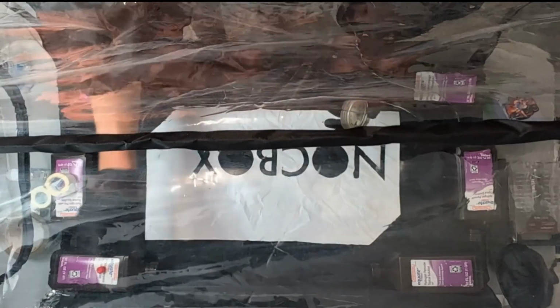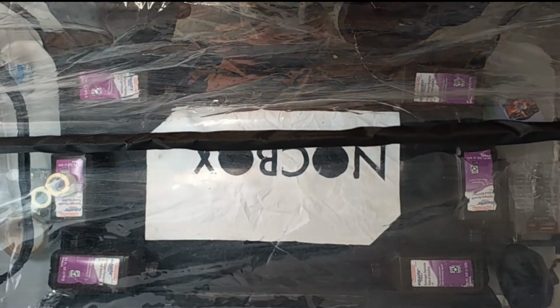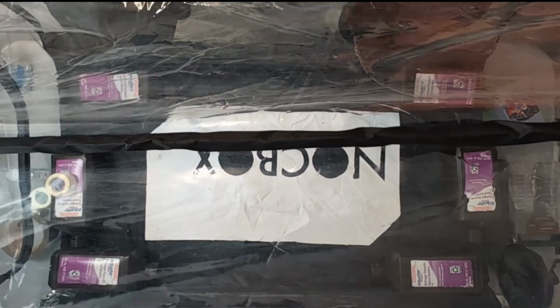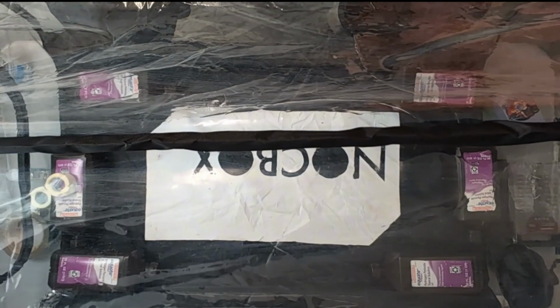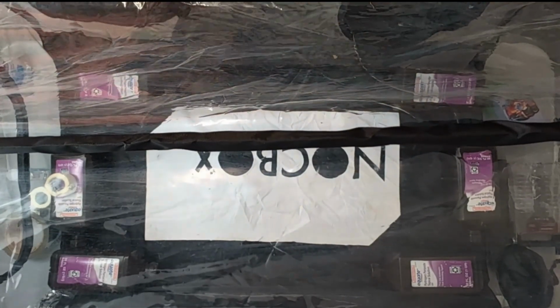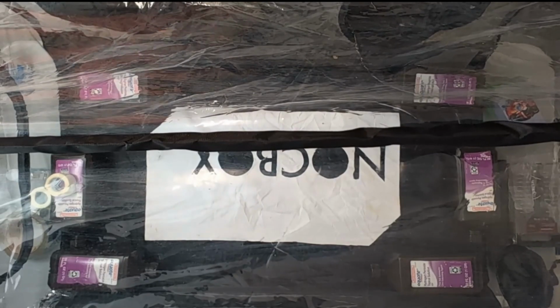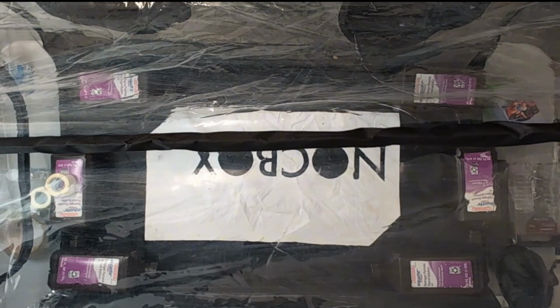Same for the scissors. I wonder about some stainless steel rods that I could run around the edges inside of the box, because I believe stainless steel is antimicrobial by nature. Whenever the microorganisms try to move around on the steel, they just rip themselves apart. But I don't know if it would guard against spores, yeast spores, and other things.